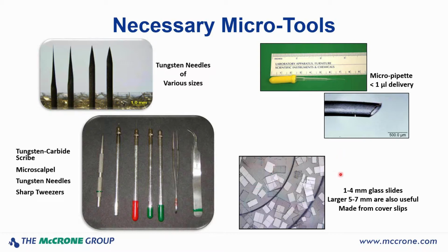These are useful for two things. First of all, they're useful if you've got a 100 or a 200 micrometer sized particle that you want to look at by polarized light microscopy. It's a whole lot easier to find that particle under a 4 by 4 millimeter cover slip than it is under an 18 by 18 millimeter cover slip. So it saves search time. It also can save on the amount of the volume of solvent or liquid that you have to use.